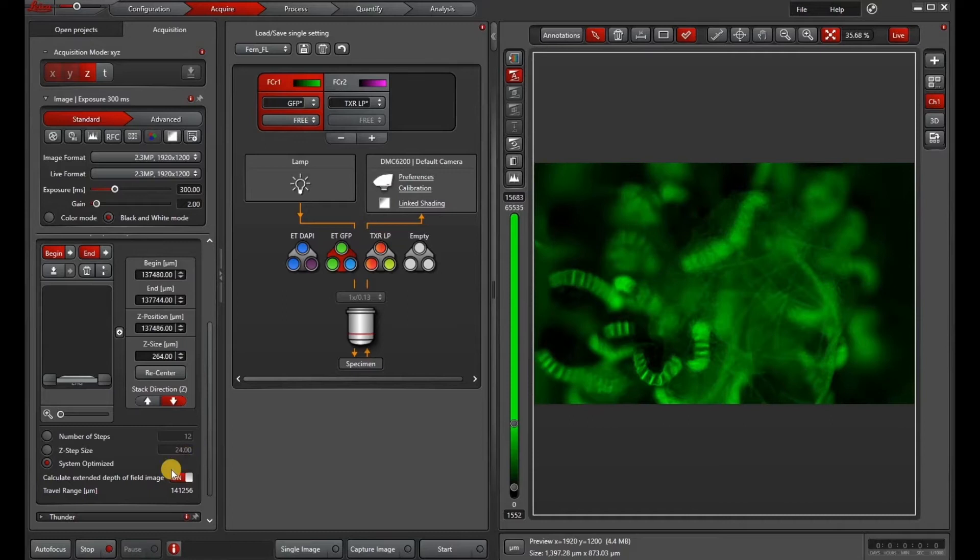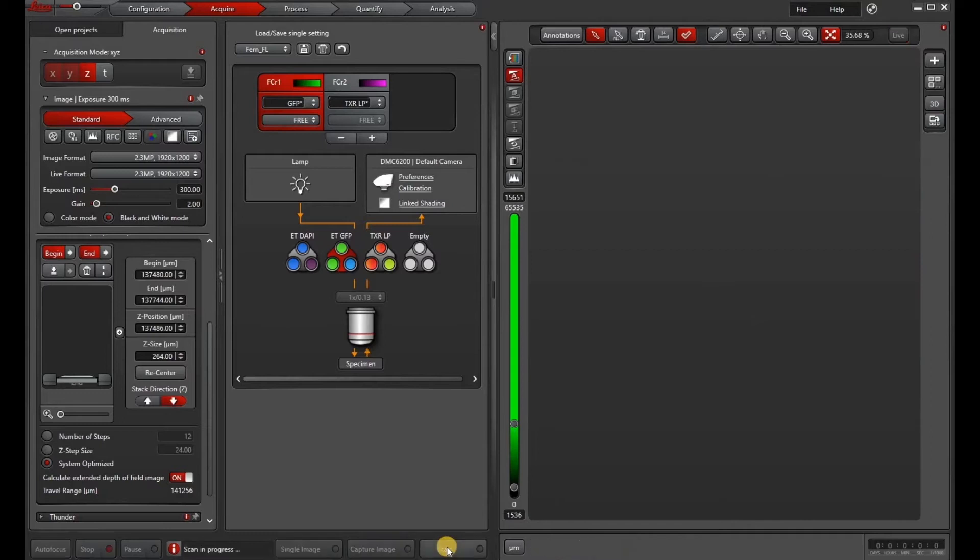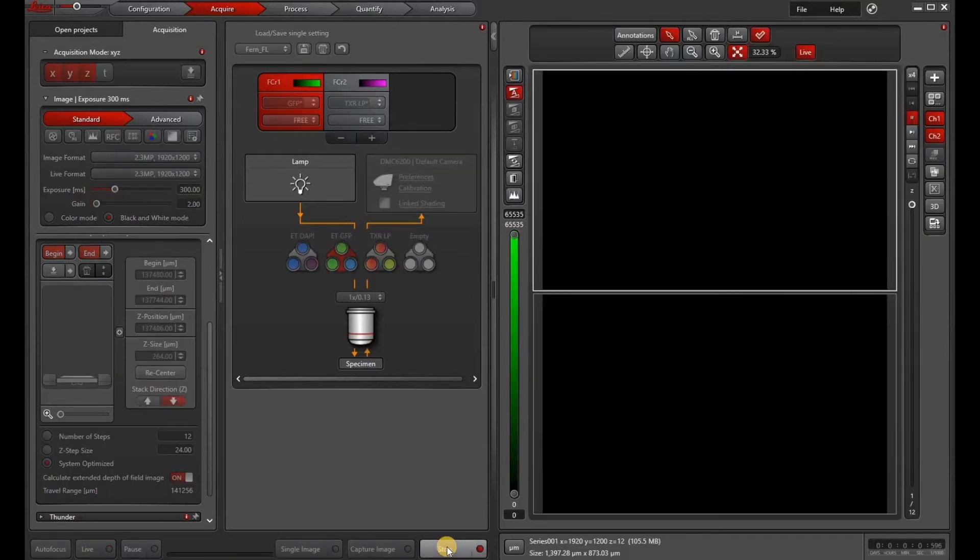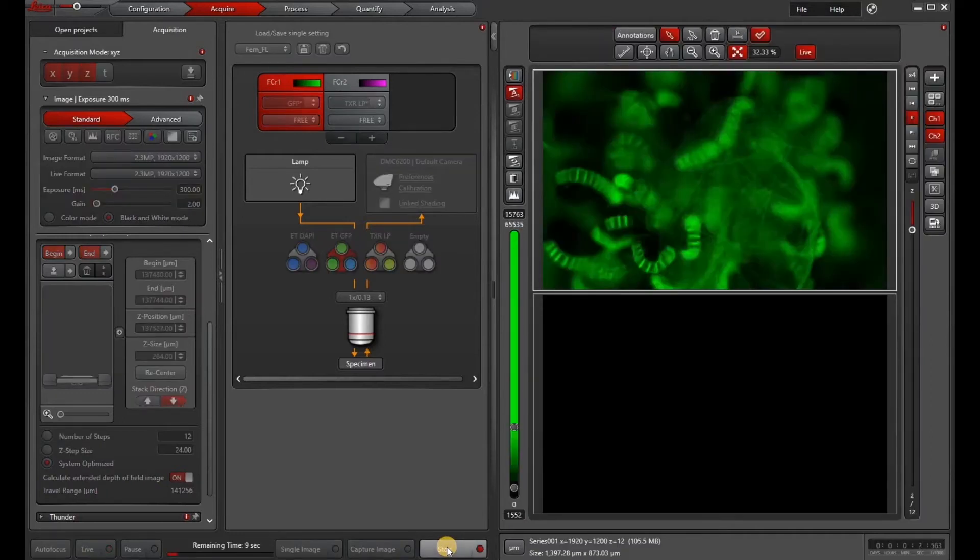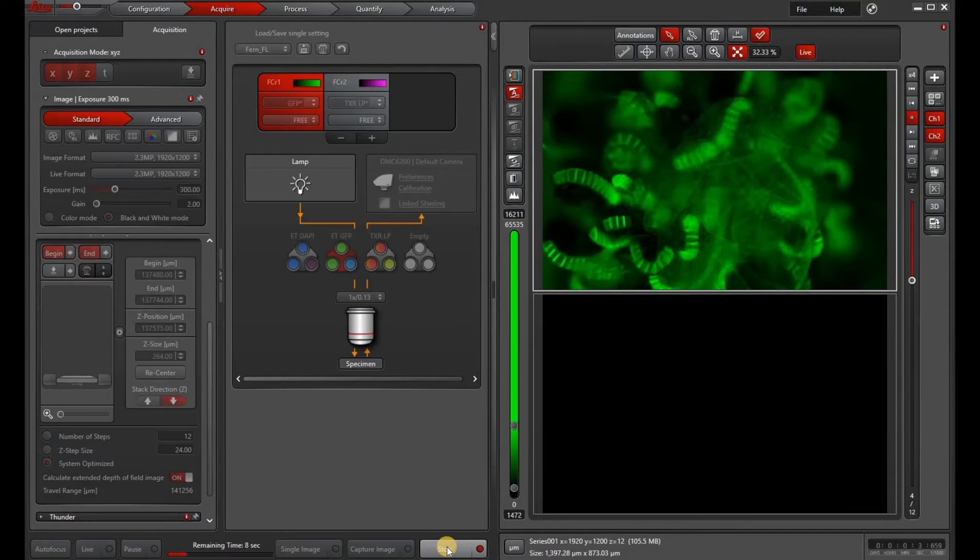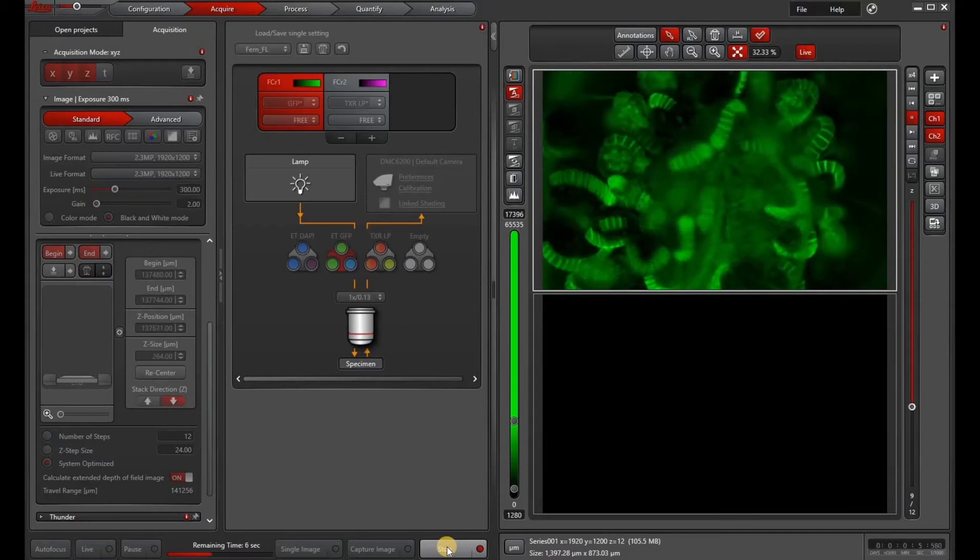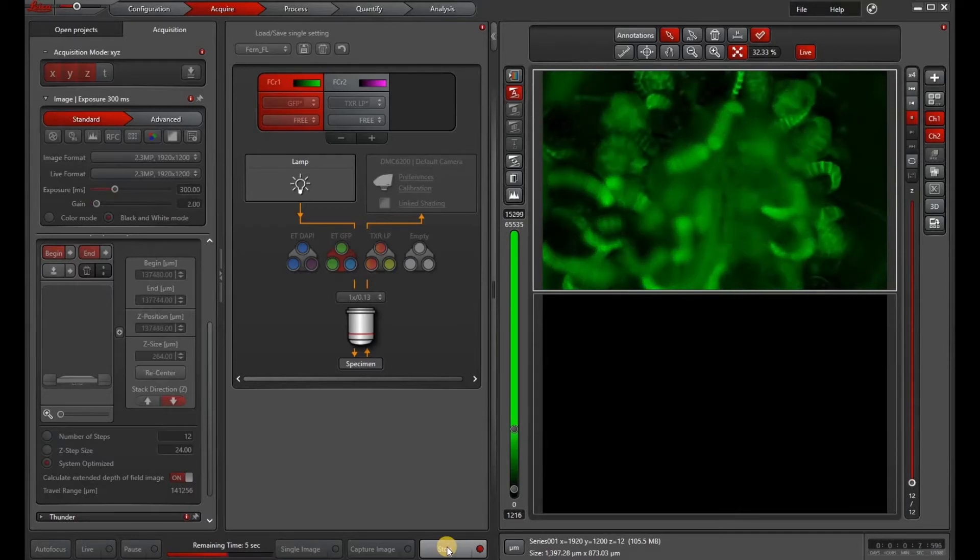The extended depth of field is a contrast-based projection of your z-stack which you can activate either before or after you acquire your image. So to activate it before you acquire the image, you need to have a license. Please consult with your account manager or your AWSW for more information, or you can do it after.